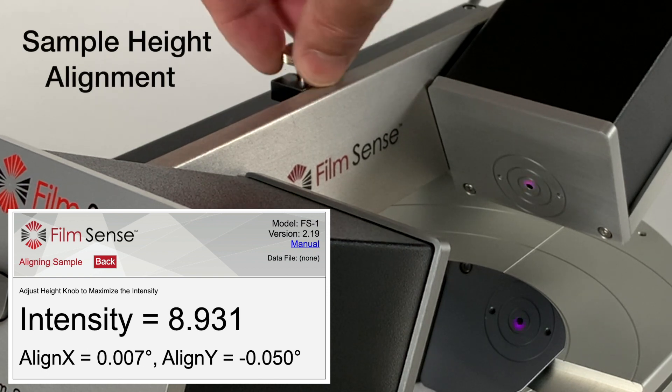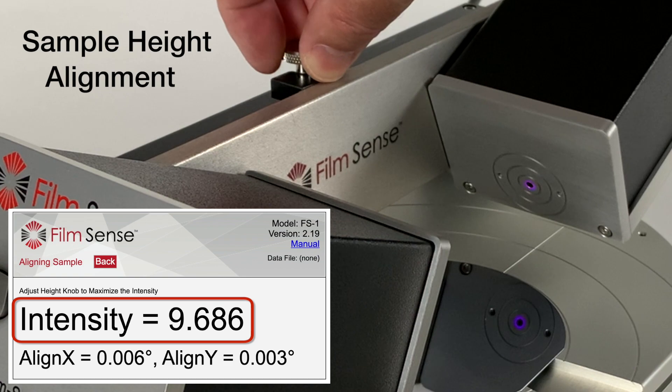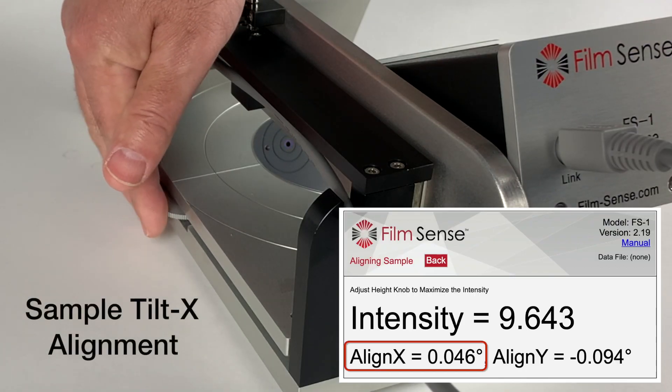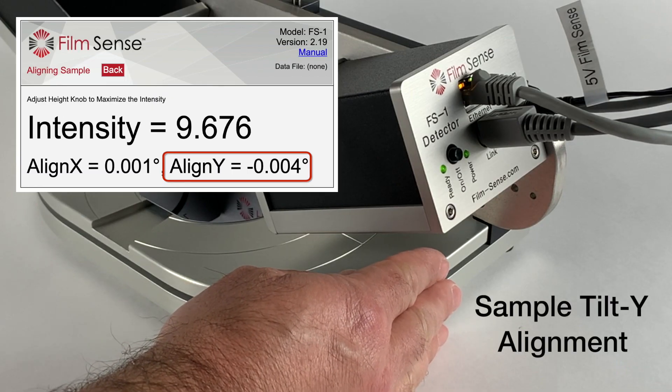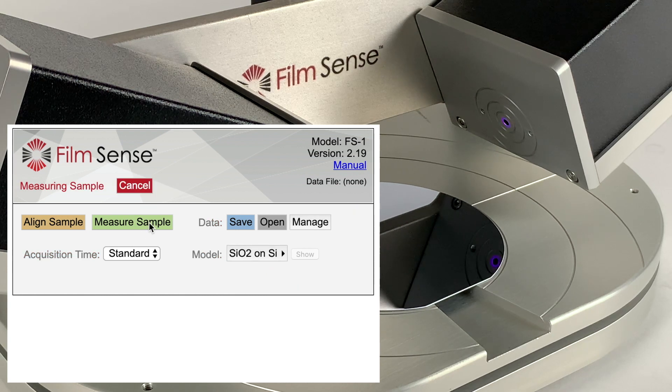Adjust the height knob to maximize the signal intensity, and adjust the tilt knobs on the right and back sides of the base to zero the Align X and Align Y values. Select the appropriate model for the sample and click the measure sample button.